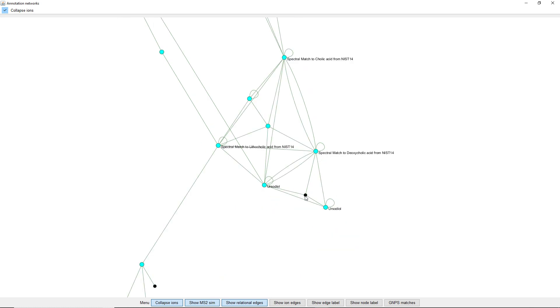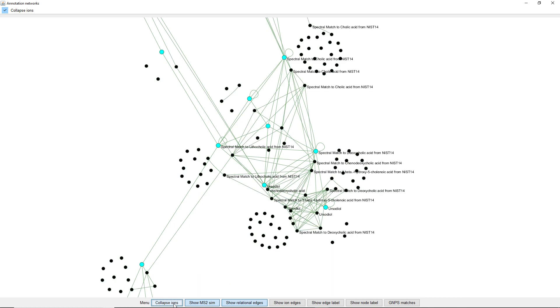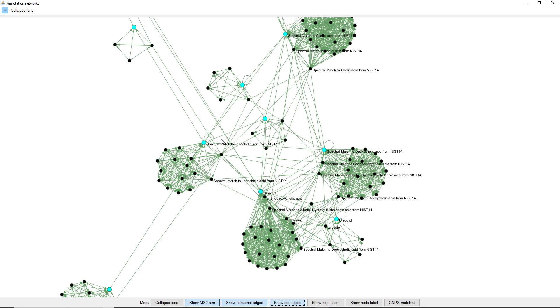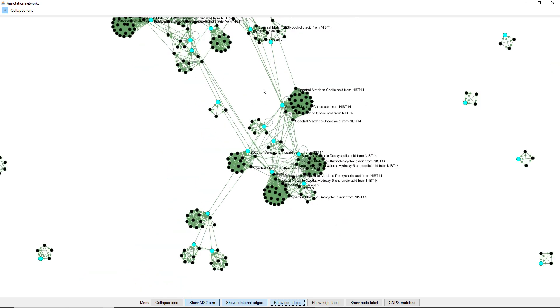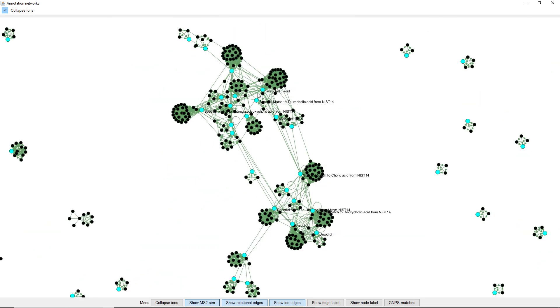We only have one feature in here which was not grouped in one of those networks. If we decollapse, we can actually see there are lots of ions here — the network is quite busy if we don't collapse the Ion Identity Networks. But with the collapsing option, it is much easier to just spot the differences and identify the neutral molecules.